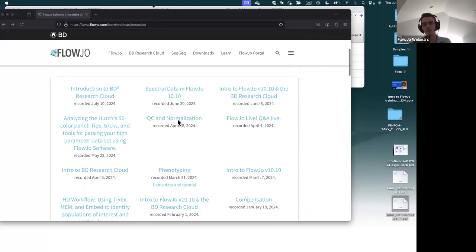There's a webinar on QC and normalization. Quality control can be useful for cleaning up the data, so it might be a good one to check out if you're getting started. And there's plenty of others. There's high dimensional webinars if you're looking at some 30, 40 color panels, maybe you want to do machine learning on the data. Those can be good for that. So there's a lot of different webinars you can check out here.